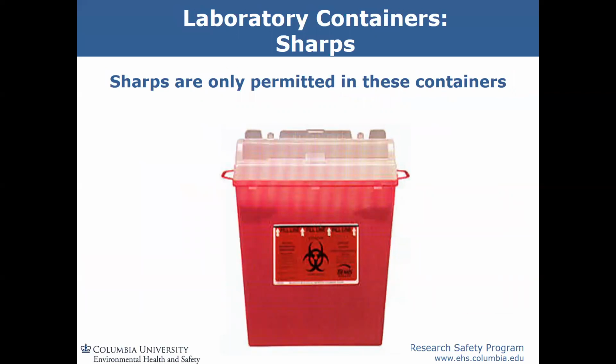Okay, sharps. Sharps containers may contain biological hazardous substances, and the best defense is to simply avoid touching them. EH&S employs a separate vendor to pick up and replace these containers. Facilities personnel should not service these containers.